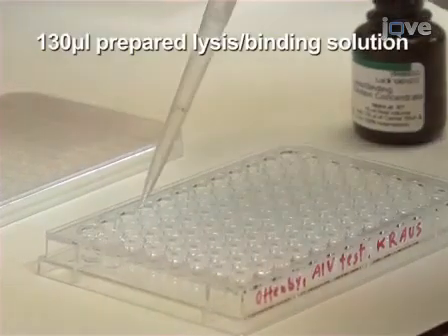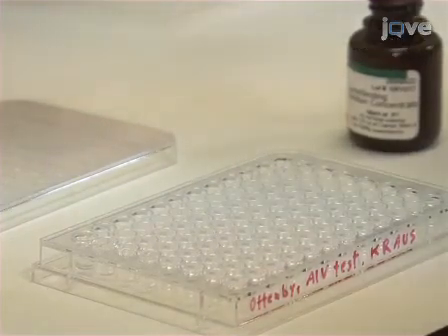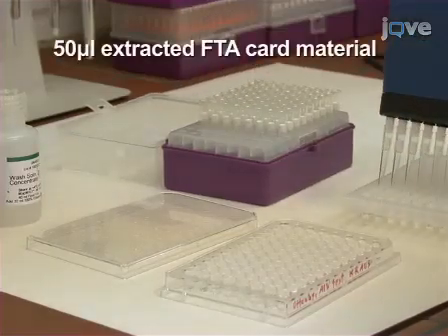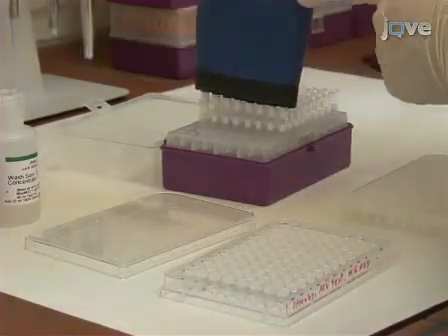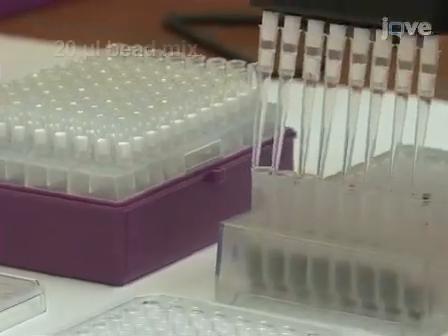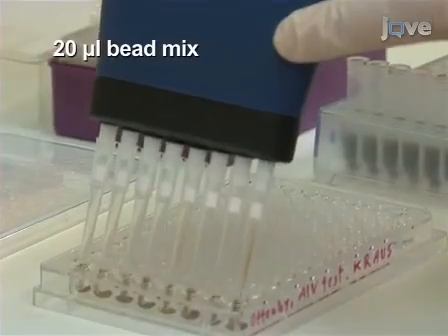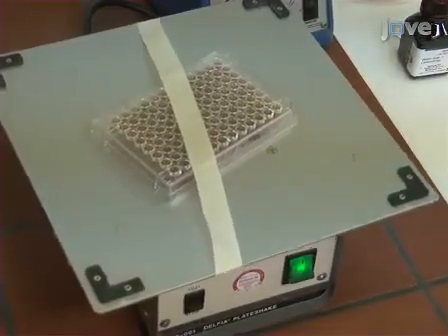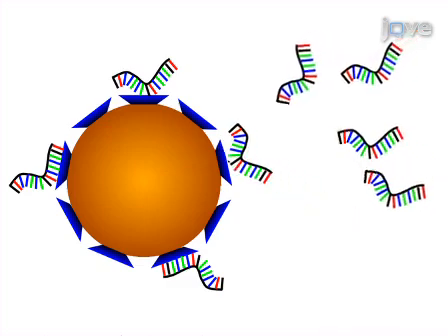Add 130 microliters of prepared lysis-binding solution, which is provided in the kit, to each well of the empty plate in the kit. Then, transfer 50 microliters of extracted FTA card material to each well. Place the plate on the shaker for 1 minute. Next, add 20 microliters of prepared bead mix from the kit to each sample and mix by pipetting up and down. Shake for 5 minutes. During this incubation, the RNA molecules will bind to the magnetic beads.